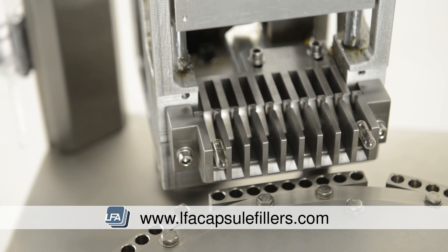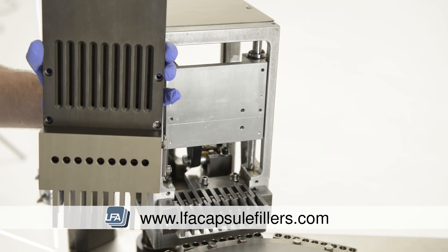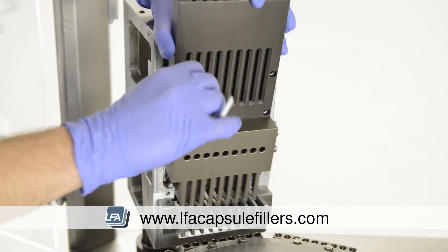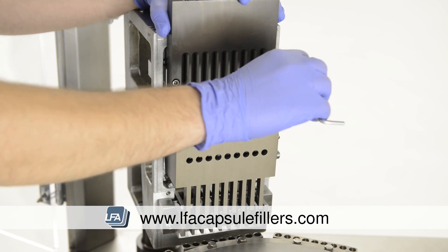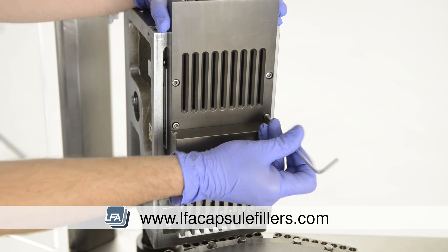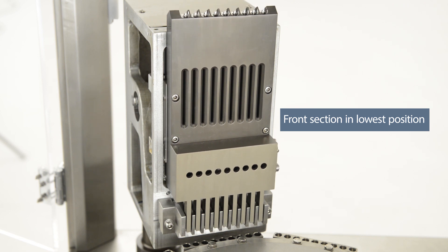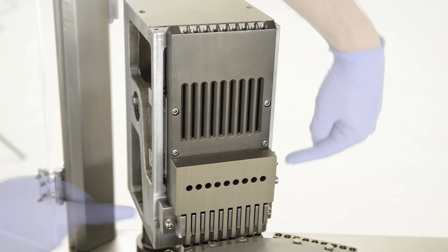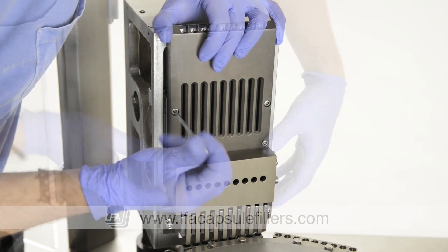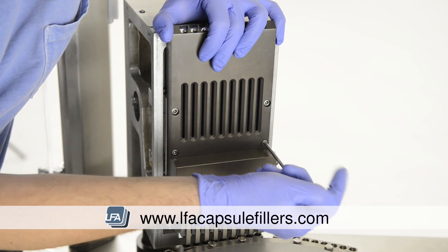Turn the machine turret by hand and listen for squeaking or rubbing sounds. Replace the front section of the capsule sewer by lining it up and replacing the four bolts with your allen key — like our other pieces, we're not going to fully tighten this section just yet. Next, rotate the machine so the front section drops down into its lowest position. Now look at the gaps along the front to ensure they are equally spaced out and not rubbing or pushing to one side.